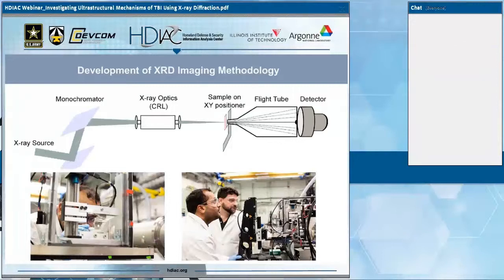So having done the isolated optic nerve work, we were well set up in terms of the X-ray diffraction methodology to progress to something somewhat more complicated. The top of the image here is showing essentially that the X-ray diffraction methodology didn't change at all. The detector system, the X-ray admittance and the focusing and the optics and so on, that was all the same. The bit that changed next for scanning brain slices was how we handled the sample. It would be at the same position, kept in the hydrated state as much as is possible under the circumstances, and then maintaining its sample position through custom-built apparatus that we made at the Illinois Institute of Technology.